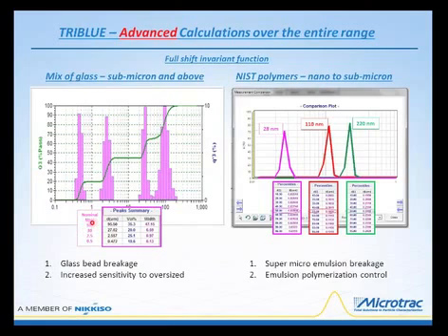Some of this is sieve sizes, some is microscopy. Microscopy is a nice image analysis technique, but it doesn't have the capability to measure a few 100,000 particles. It would take a very, very long time to do that. So these are nominal values. They're not certified by NIST.